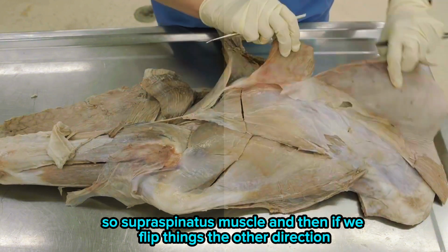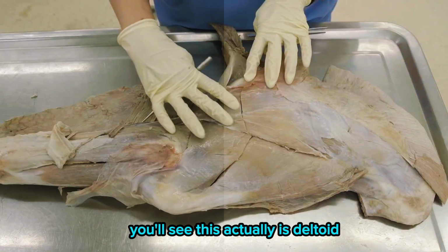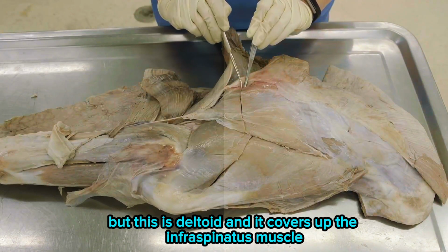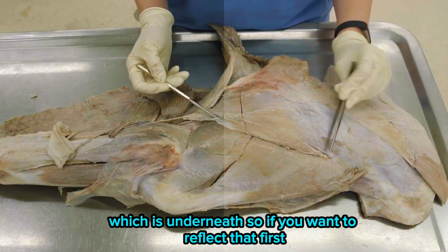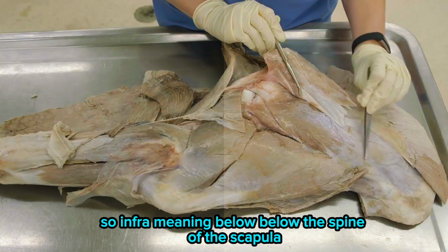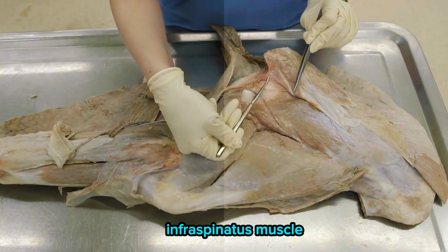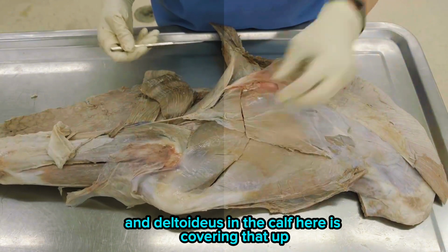And then if we flip things the other direction, you'll see this actually is deltoideus. So I'll kind of outline it here for you. But this is deltoideus, and it covers up the infraspinatus muscle, which is underneath. So if you want to reflect that first, then you can see the infraspinatus muscle here. So infra meaning below the spine of the scapula, infraspinatus muscle. And deltoideus in the calf here is covering that up.